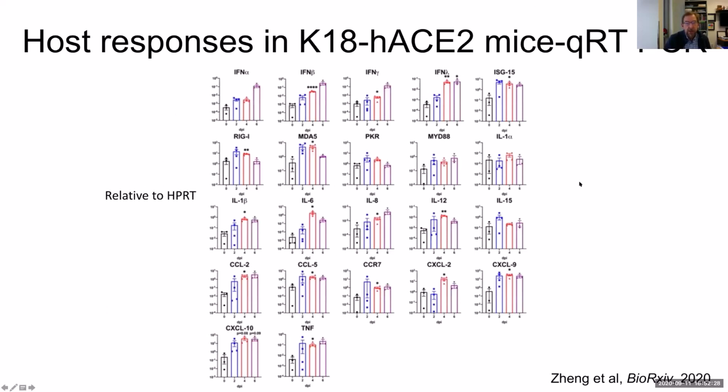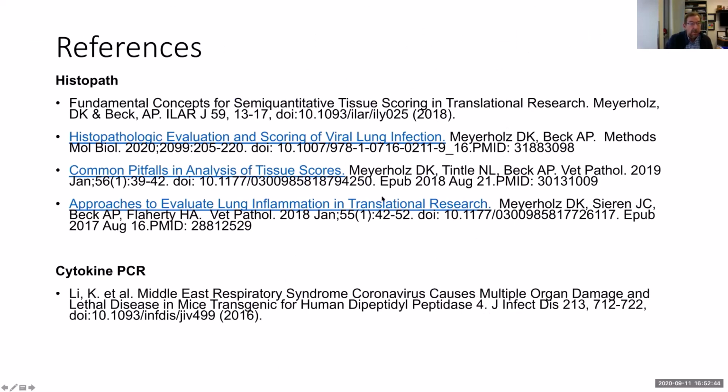And this is just an example of using qRT-PCR to profile a number of host response genes of interest at different days post-infection. And then I put some histopath references and a cytokine PCR reference at the end. So that's what I have to run through.